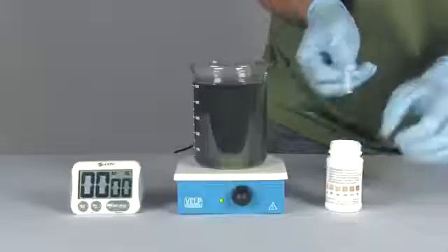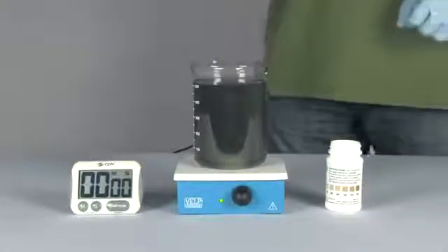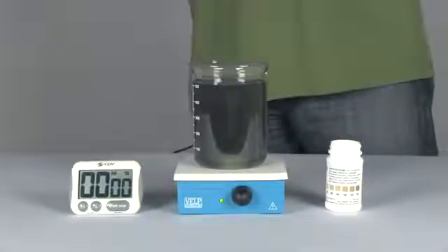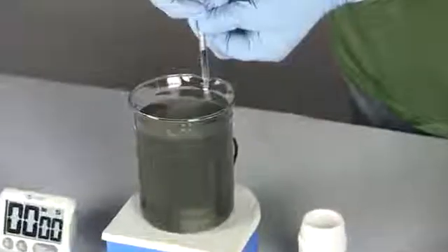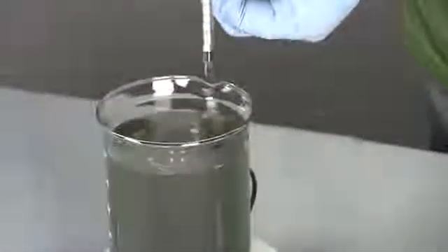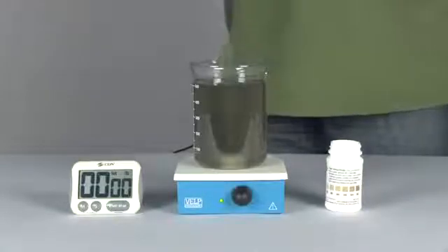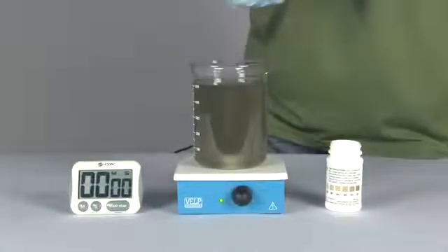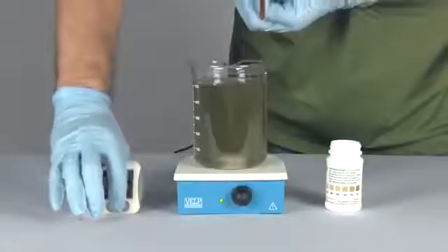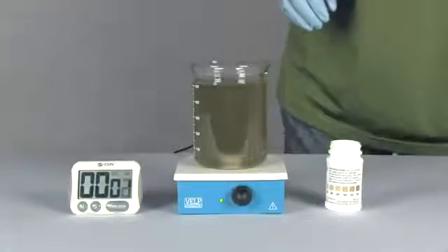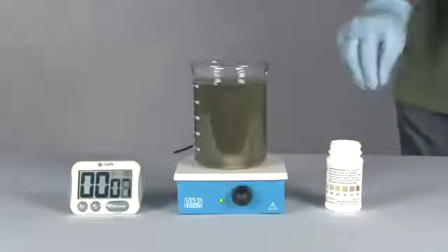0.3 milliliters of hydrogen peroxide and 0.1 milliliters of Ultra S3 are added to the solution. The peroxide and S3 are allowed to oxidize the hydrogen sulfide for 30 seconds.